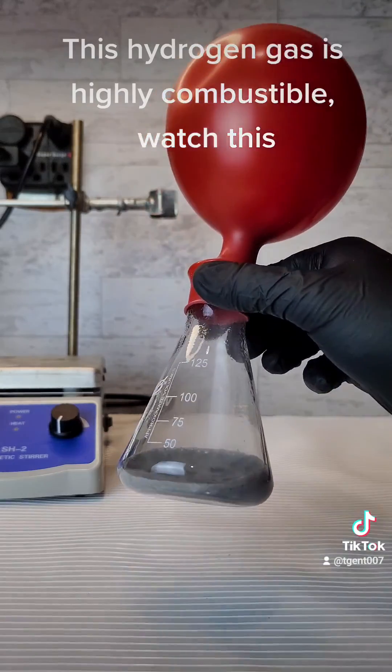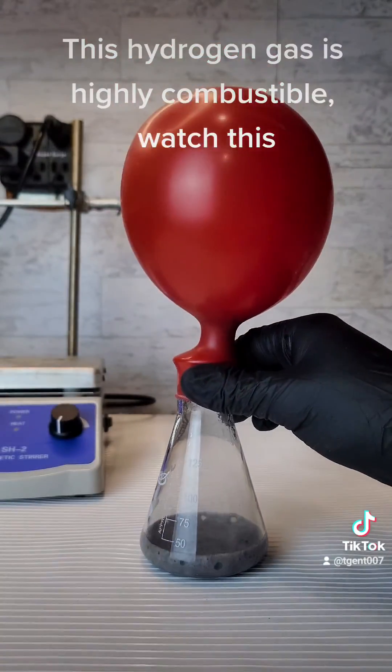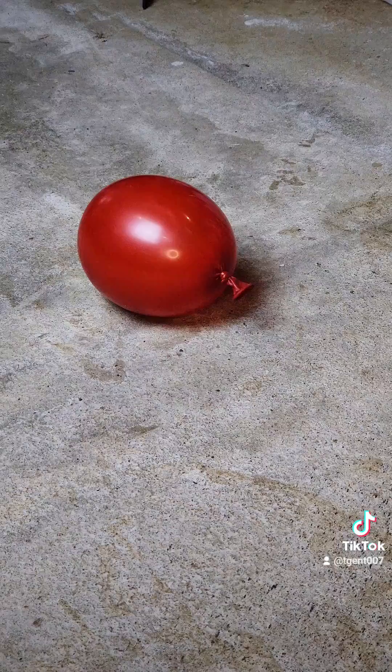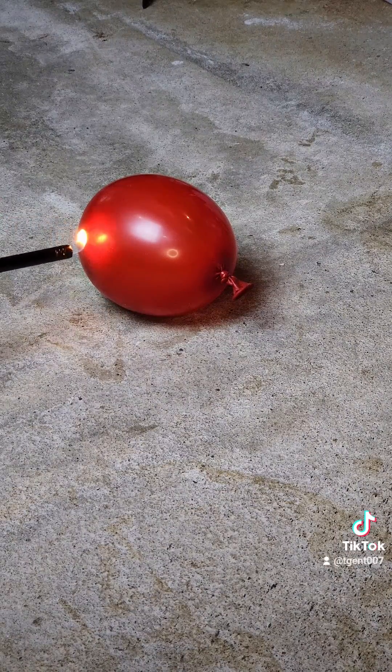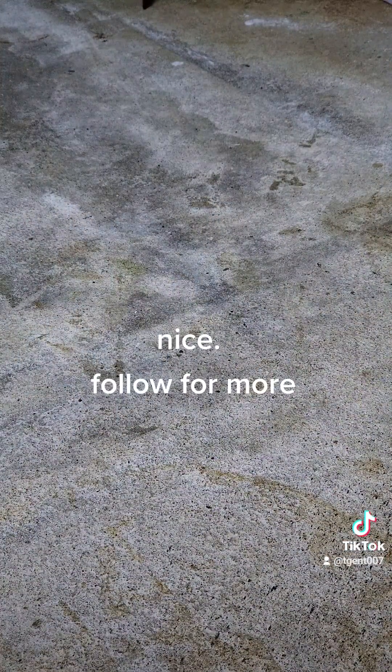This hydrogen gas is highly combustible. Watch this. Nice. Follow for more.